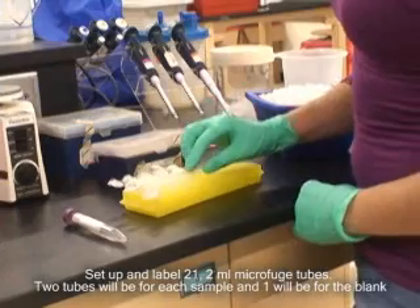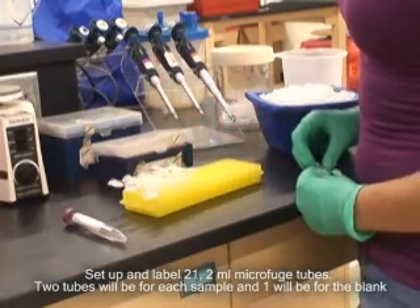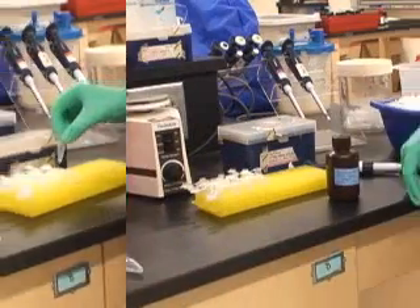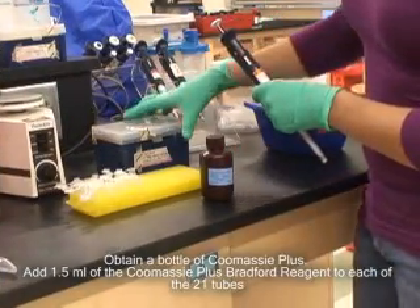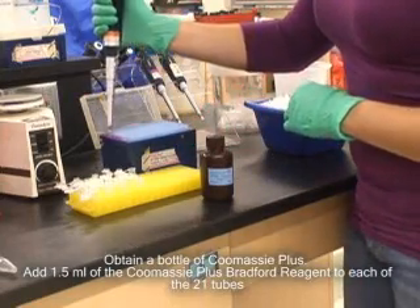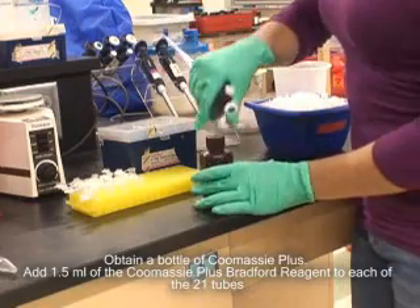Set up and label 21 2 ml microfuge tubes. Two tubes will be for each sample and one will be for the blank. Obtain a bottle of Coomassie Plus and add 1.5 ml of Coomassie Plus Bradford reagent to each of the 21 tubes.